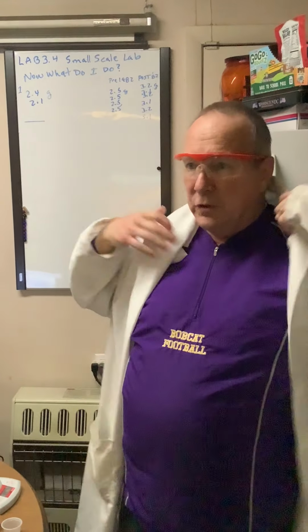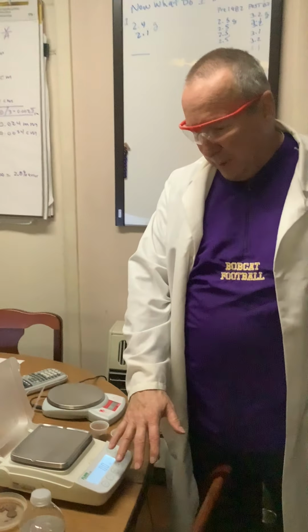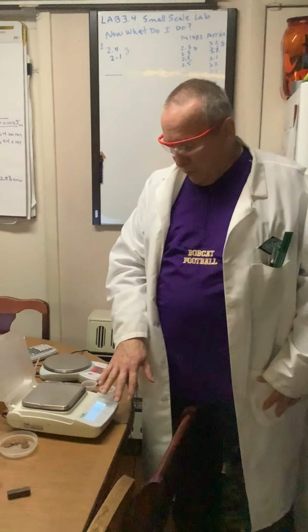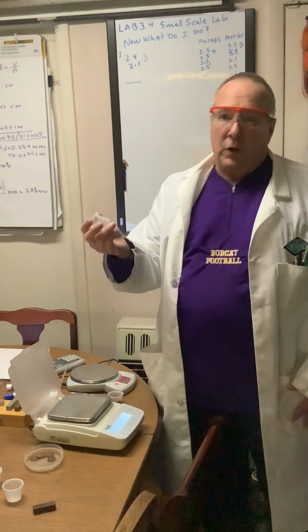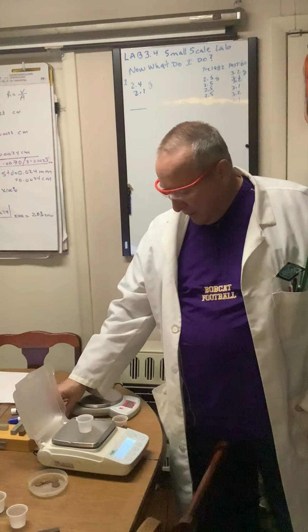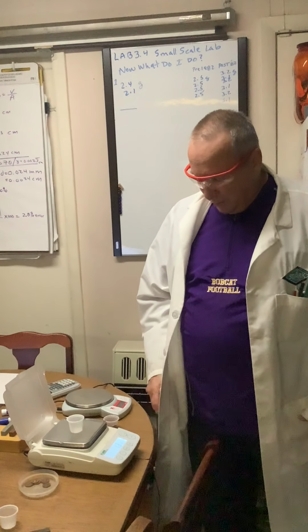Measure the mass of 50 drops of water. So I'm going to do that. I have a balance here. I'm going to use this one because the lit up screen on it allows better photography. And I have a small, we call it a portion control cup. You'll see I hand out chemicals and things in small portions and control the portions in them. And when I put it on, it's 1.3 grams.